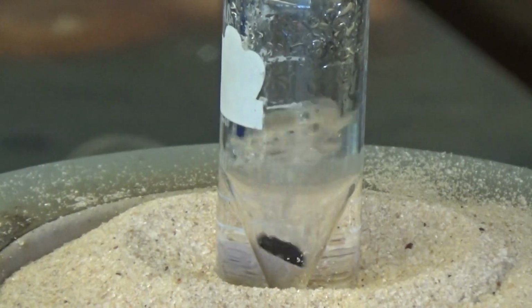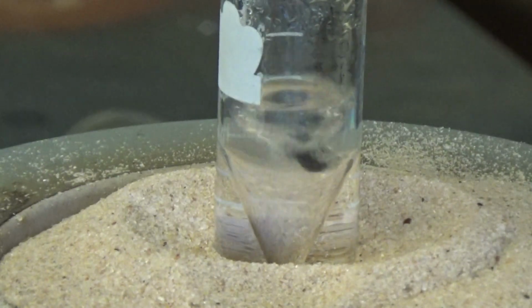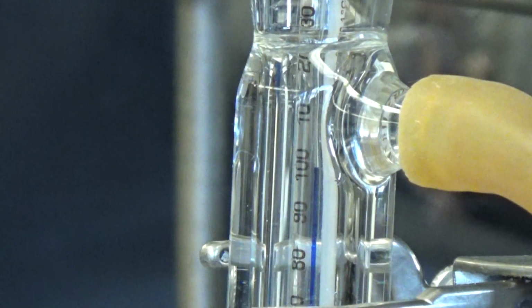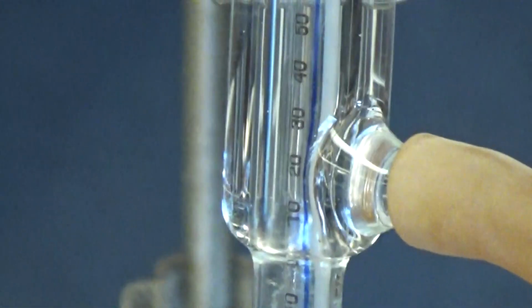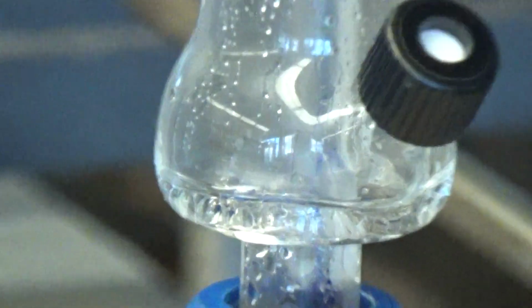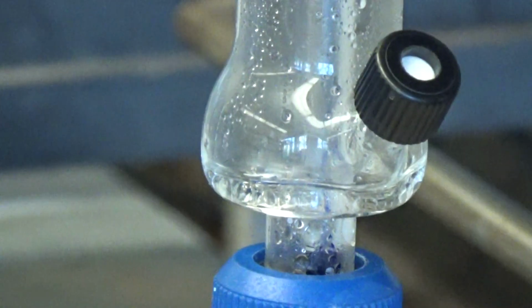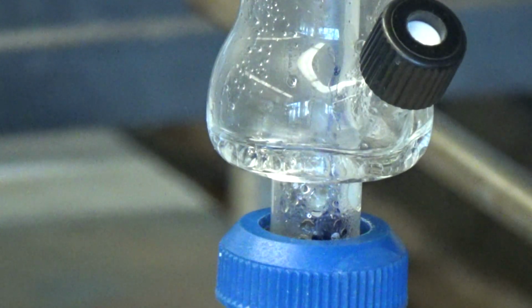Almost there. It's cool. It's like little mini explosions of the boiling chip as it heats, and then the product's there. Temperature is actually 100 right now. And as you can see, you have tons of product. 100% yield? No, I don't know. We'll find out.